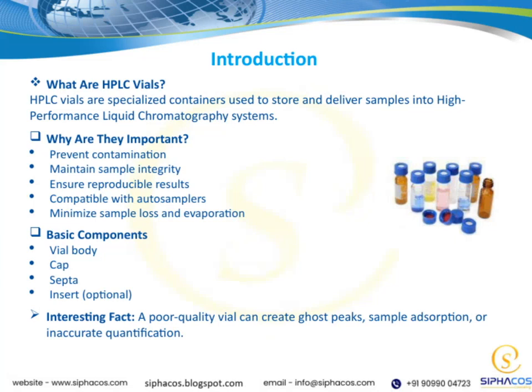Welcome to the next part of our presentation. Let's start with the basics. What are HPLC vials? HPLC vials are specialized containers designed specifically for storing and delivering samples into high-performance liquid chromatography systems. They play a crucial role in ensuring the accuracy and reliability of our analytical results.